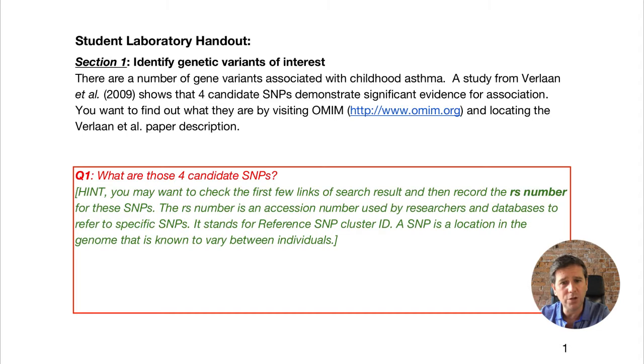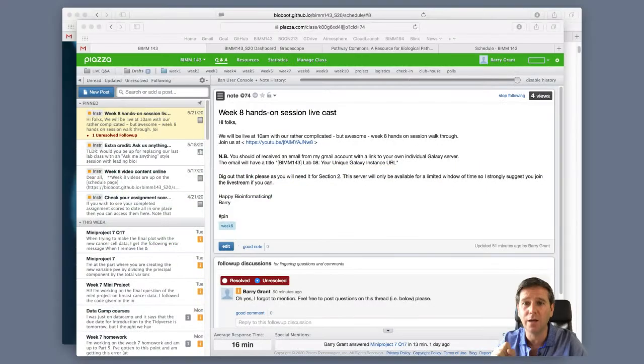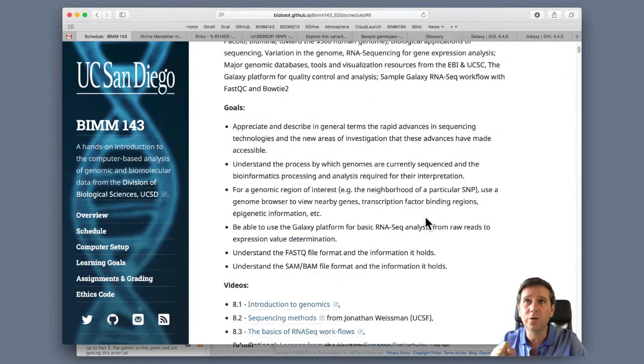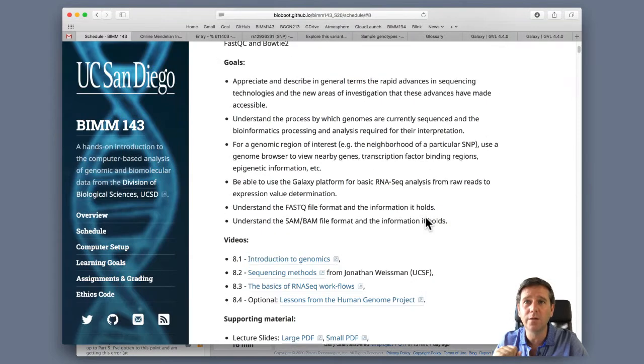So we're going to do that with childhood asthma today, and I'm going to pop over to our class website. This is not our class website, this is our Piazza forum, but here's our class website underneath. So we're on week 8, of course, genome informatics.